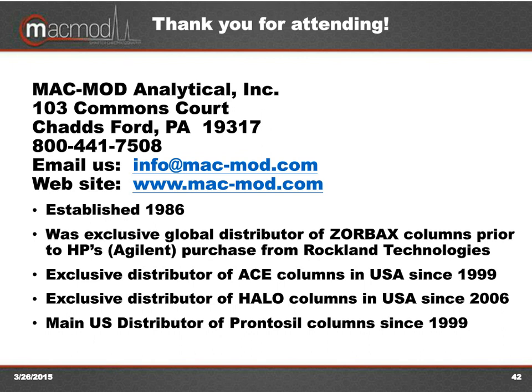There are tools out there like www.hplccolumns.org, and the USP site also has the same database that was really developed from work done over a long period of time between Snyder, Dolan, and Carr and collaborators.